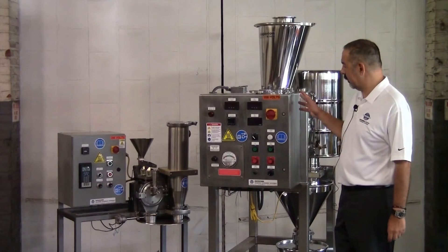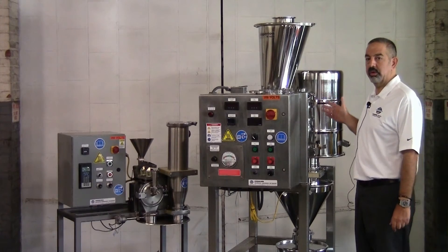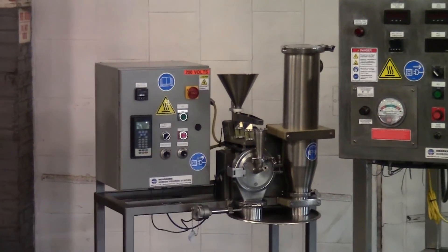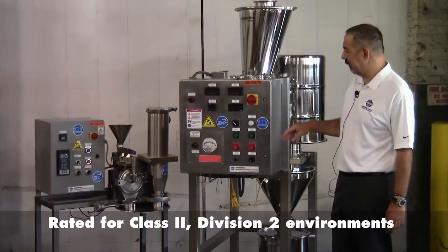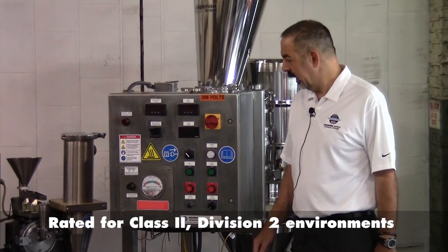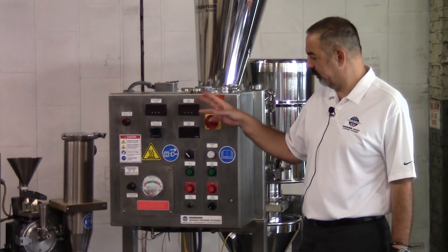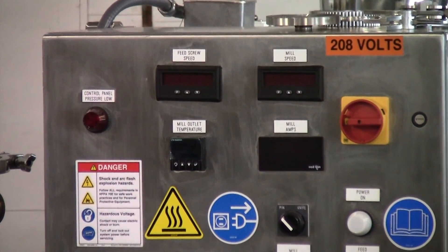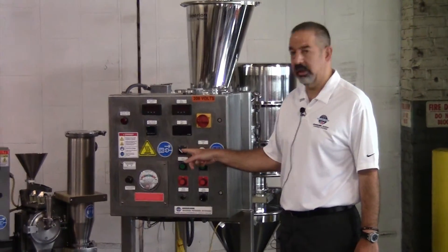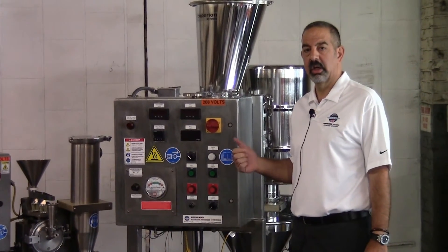I wanted to point out some of the minor differences on the controls as well. This unit being pharmaceutical, it was constructed in all stainless steel, from the structural base to the guards, including the control panel, which is a NEMA 4X design — compared to our standard unit's gray steel NEMA 4X box. We have included a Z purge on this unit for it to be operational in a Class II Division II area. We also have VFD controlling the main motor speed as well as the feeder speed, so we have amperage, mill speed display, and feeder speed display. Additionally, since this is capable of handling multiple different types of rotors that could run at different top speeds, we have a selector switch that will allow you to pick the rotor type so that the unit automatically locks into a top speed and does not exceed the designated speed of a given rotor.